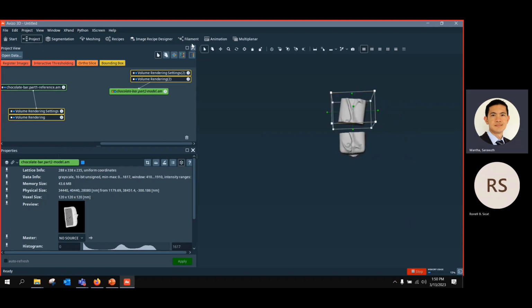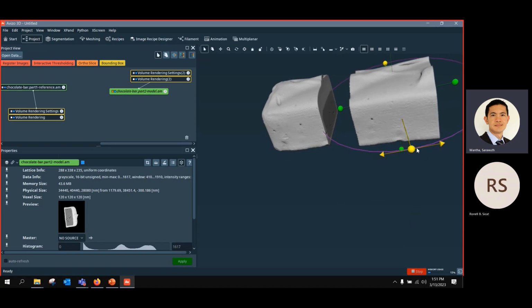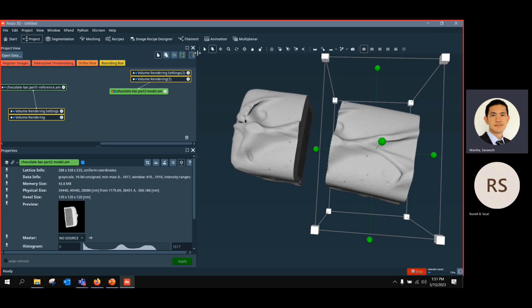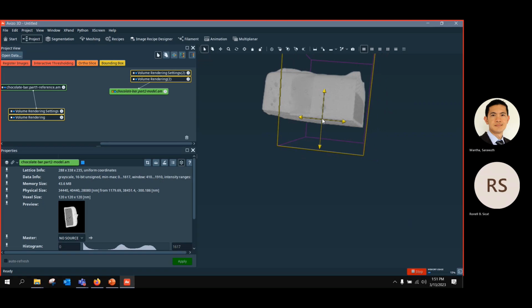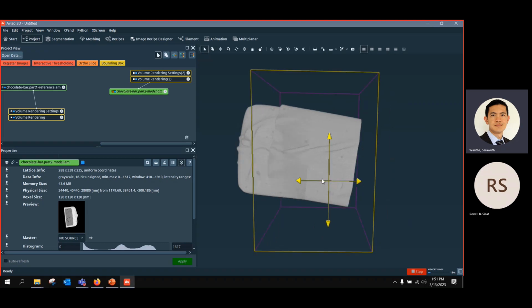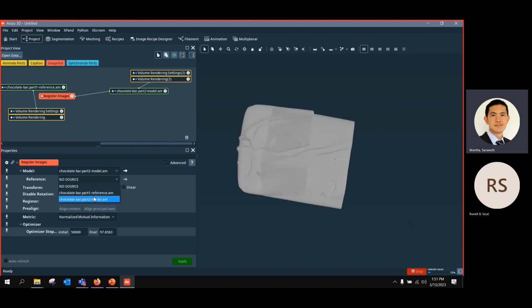And you can see that when they are not too close to each other, the volume rendering becomes nice. But when they are overlapping, the volume rendering fails a bit to visualize both of them nicely. So now I just move them closer to each other like this. Yeah, almost there. I think maybe I try to get a bit closer like this. And then ready. So I go to register images again, attach the reference part, and then click apply.